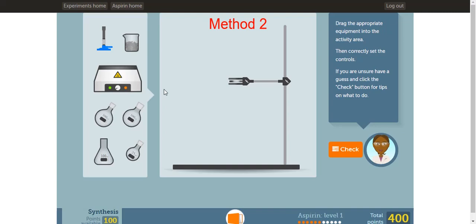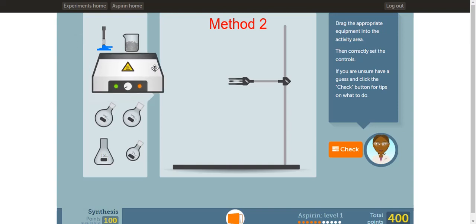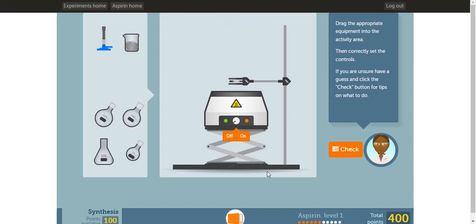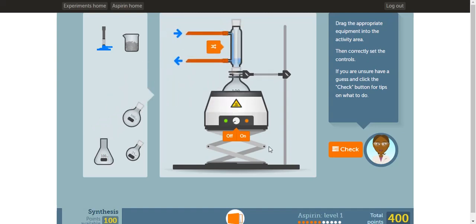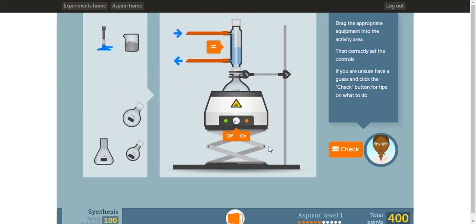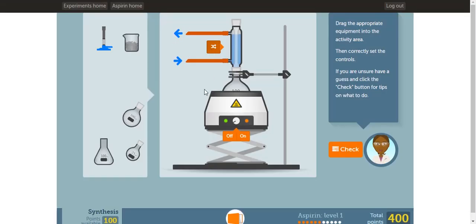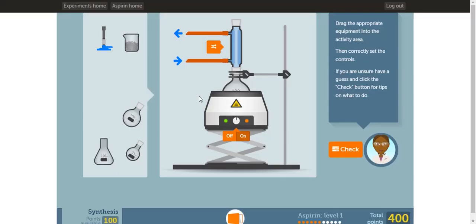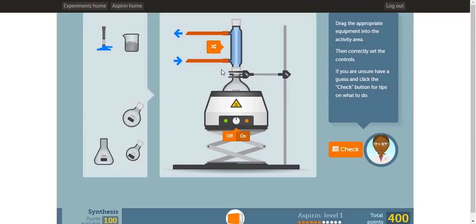This is the second method of setting up this reaction. Instead of using the Bunsen burner, you'll be using the heating mantle. Drag the heating mantle to the lab station. That is the only thing different — everything else is the same. Same as before, drag the small neck round bottom flask onto the heating mantle. Next, you want to revert the water flow so the condenser is completely filled with cold water. Next, you want to turn on the heating mantle. To prevent shaking of the round bottom flask, add the anti-bumping chips. Now your setup is complete, click check to move on.